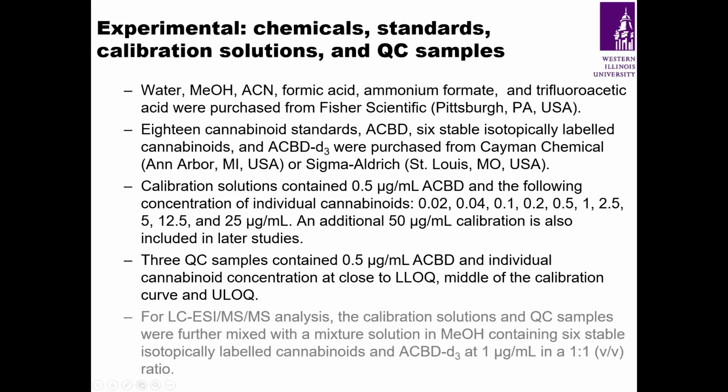Now we proceed to the experimental. Chemicals, standards, calibration solutions, and QC samples are listed here. It is noted that the PDF version of the slides will be available as an archived resource, so I'm not going through the details of these.